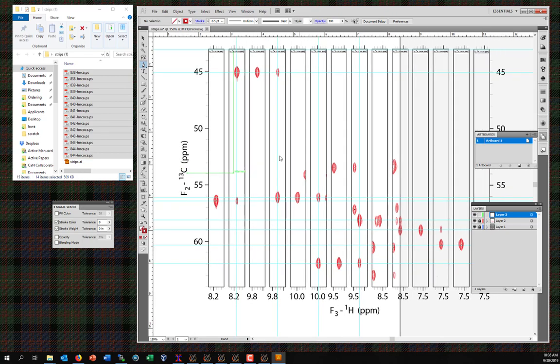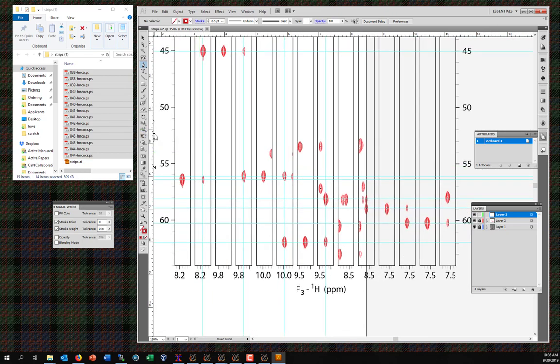And so this is going to get pretty grid heavy. Lots of grid lines, but c'est la vie, that's what you need. You don't want to run the risk of not having a nice clean line.